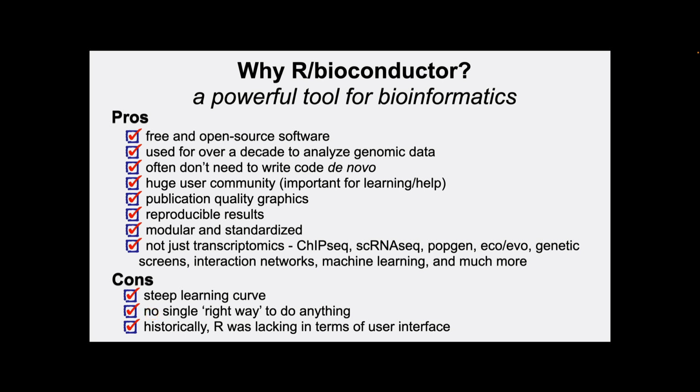There's many different tools, for example, for mapping reads to a reference. So we will talk a little bit about the tools that I like to use, but just be aware they're not the only option for doing the things that we'll do.